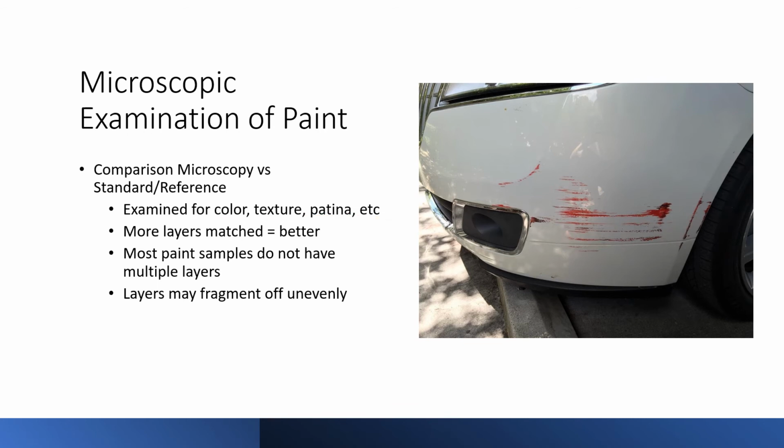Remember, when you have car paint, you have potentially transfer of a bunch of different layers. You can look at those layers sideways and see the stacking up of those layers from the bottom electrocoat primer, hopefully, all the way up to the clear coat and whatever else might be in between. There's times with your cars that you'll have more than those 4 layers. Those are just the 4 layers that every car always has.